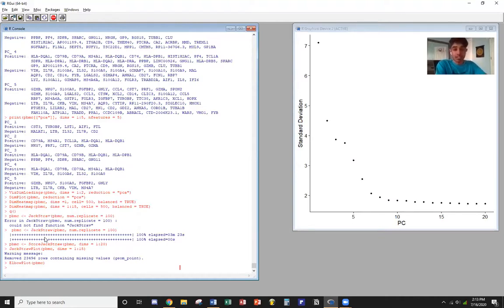This means increased values lead to a greater number of clusters. Satija Lab, the software and the tutorials I've derived this through my research, is the website that I'd recommend using. They suggest that 0.4 to 1.2 typically returns a good result for single cell data sets of around 3K cells. Optimal resolution often increases for larger data sets. These clusters can be found through the Idents function.